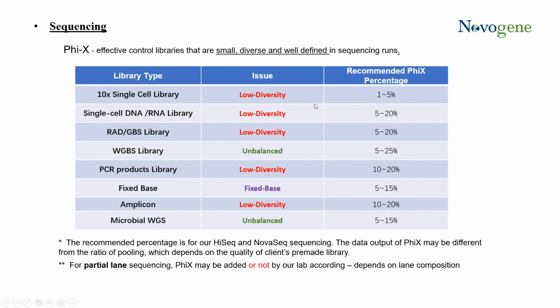But in your true sequence, there is a base that's a G. Given the outside noise and the calls previous, the machine might not be able to detect a varying base. And this is purely because of the resolution of the signal to noise ratio. So we can offset that by including known sequences to validate a potential base call. So this is why we would want to do that for low diversity libraries.